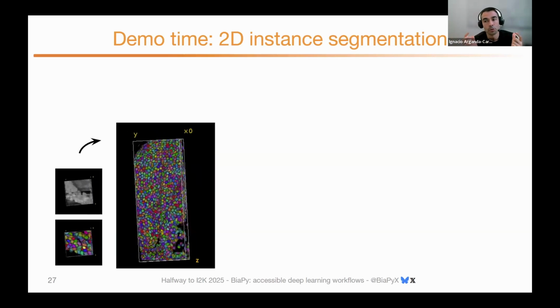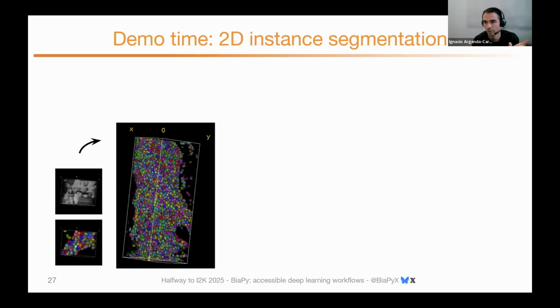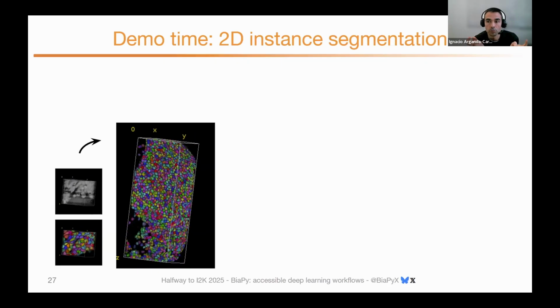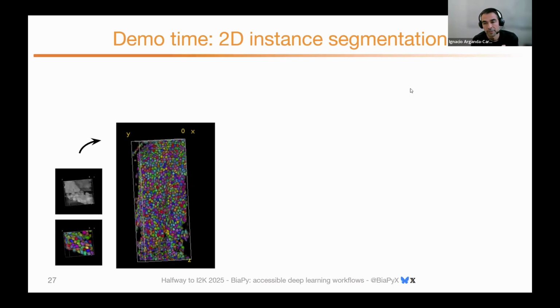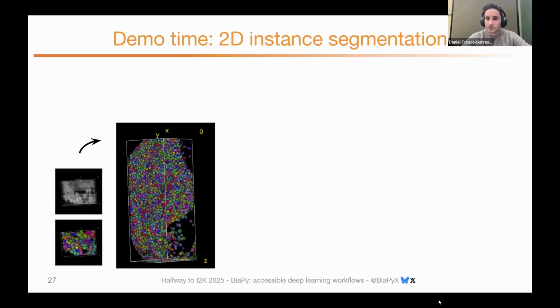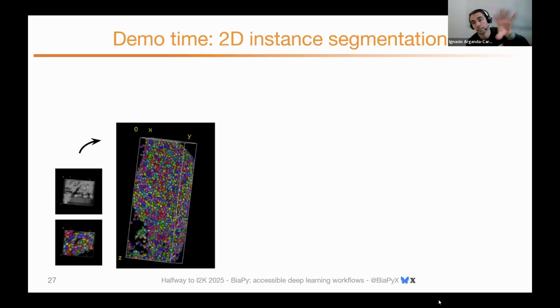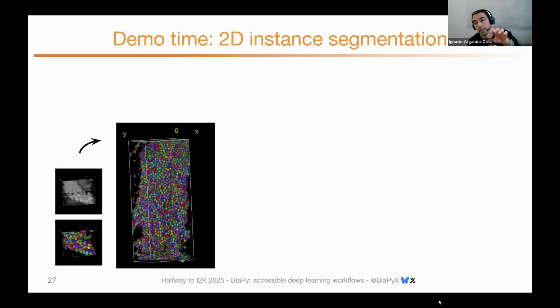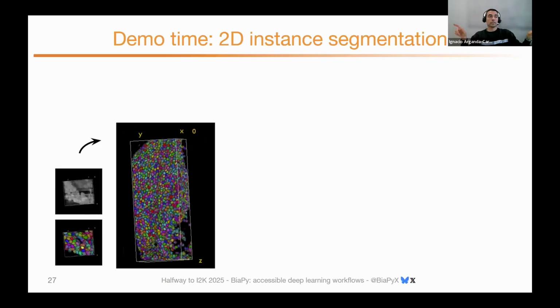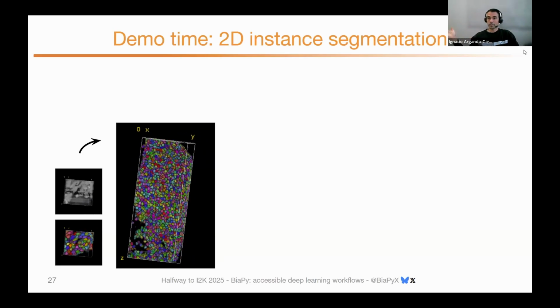Very briefly, we don't plan to incorporate Microsam. We see each other as complementary. But what we do have in preparation is to use strategies such as Cellpose and StarDist, that we can go straight and apply, that work very well for this type of images, and then reuse the full structure of BiaPy to, for example, run it at a big scale.